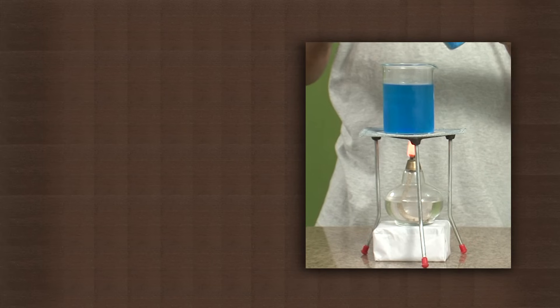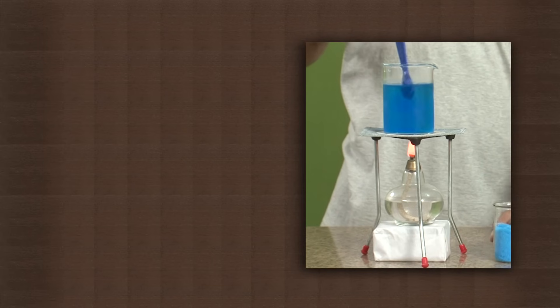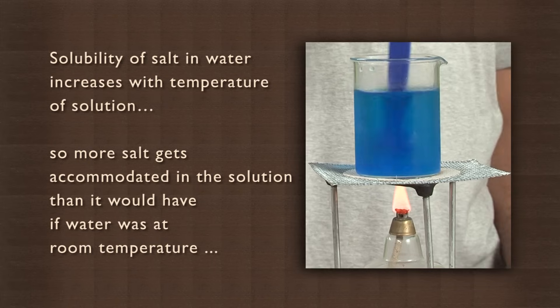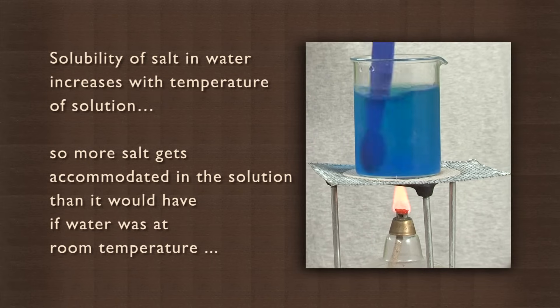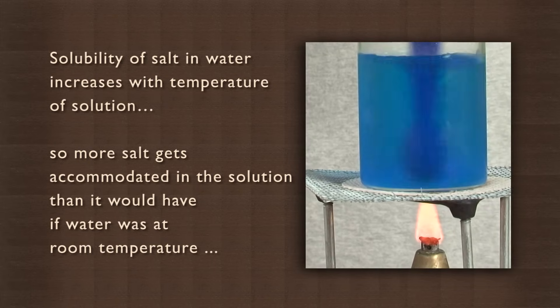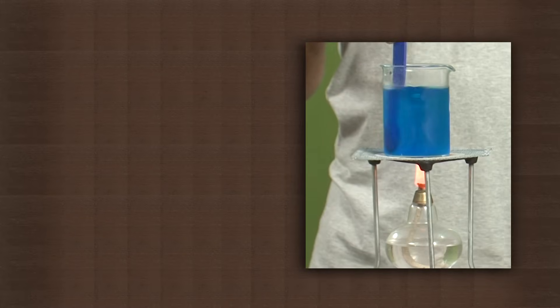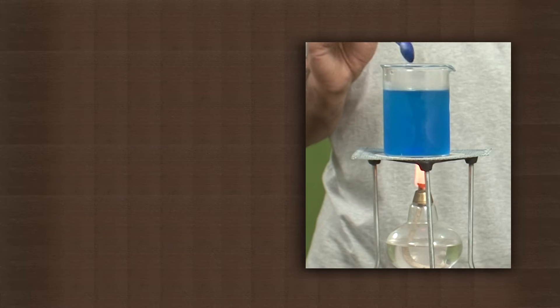This happens because the solubility of salt in water increases with temperature of solution. So more salt gets accommodated in the solution than it would have if water was at room temperature. This solution is called a super saturated solution.